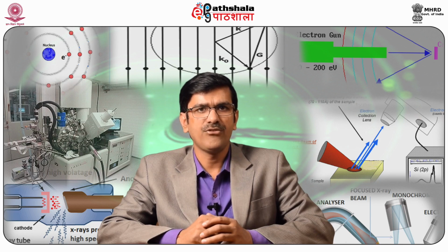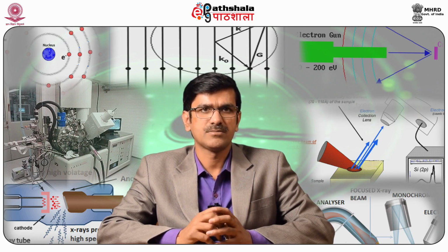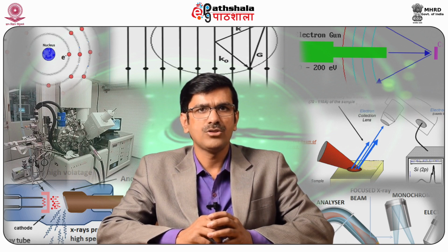Thus, it can give huge information about different types of chemical bonds in a material. XPS also offers non-destructive depth profiling, called angle resolved XPS or AR XPS. In AR XPS, without etching the specimen, depth information can be obtained. Along with qualitative analysis, quantification of chemical composition is also possible.